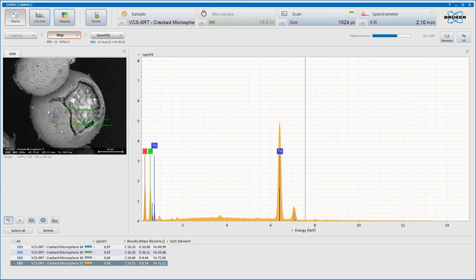Now we have quite a large number of these large spheres. It really would be good to get this under a laser time of flight MALDI system, maybe, and try and get an idea of whether this is a single isotope. Is it iron 56? Who can say?